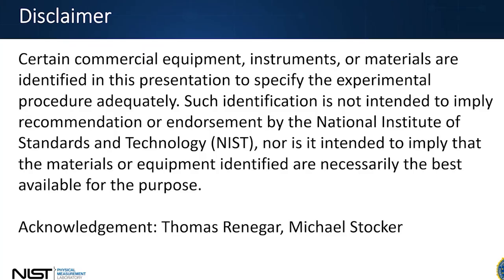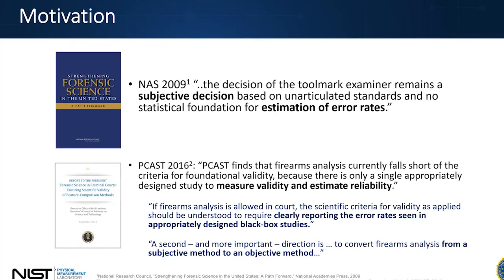So what is the motivation in this movement towards 3D instrumentation? Well, you all know about the NAS report, you know about the PCAST report, and I'm sure there's going to be future reports until this problem is resolved. And basically, we want to go towards a more objective metric and provide statistical weight of evidence for examiners. And this is not there to replace examiners, it's there to help support an examiner's conclusion. And to do this, we need to take measurements, and we'll get into that in a little bit.